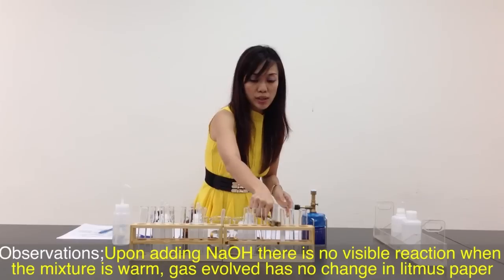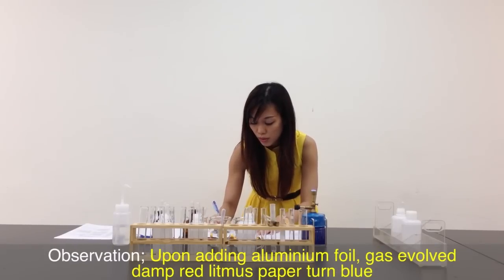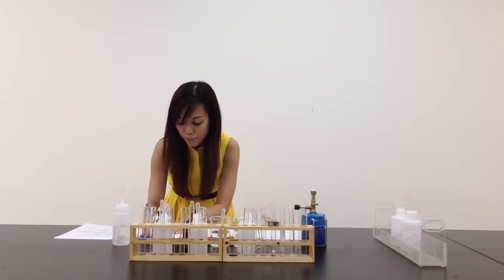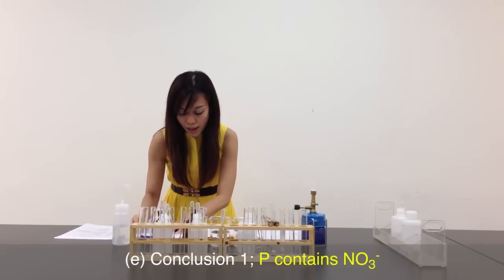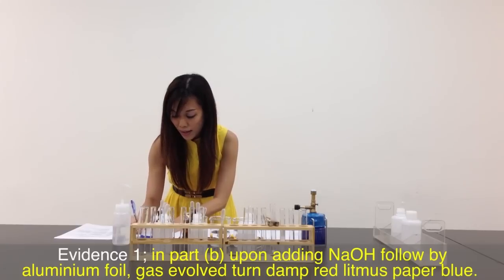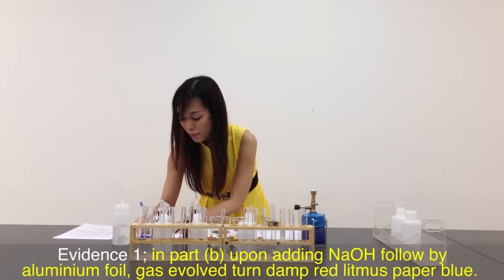Let me write down my observation. When I added sodium hydroxide, there was no visible reaction with NaOH, and no visible reaction with litmus paper for the first portion. However, when I added the aluminium foil and tested with litmus paper, the red litmus paper turned blue. It shows that nitrate is present. So I go to my conclusion and write down that P contains nitrate. My evidence will be in Part B: when NaOH is added followed by aluminium foil, gas evolved turns damp red litmus paper blue — ammonia is present.